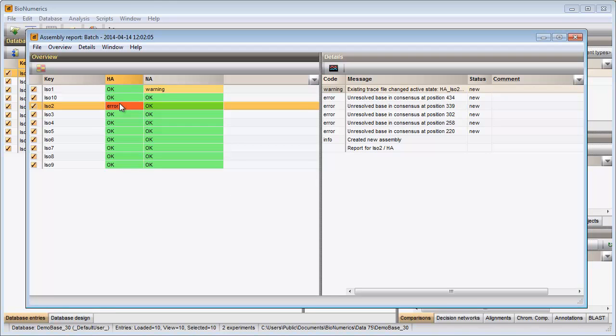When I click on the cell, the details are updated in the details panel on the right-hand side. When I double-click on a message, the assembly window opens.